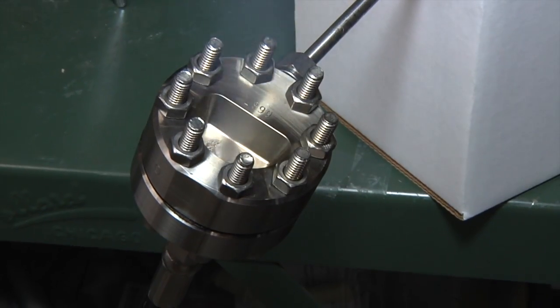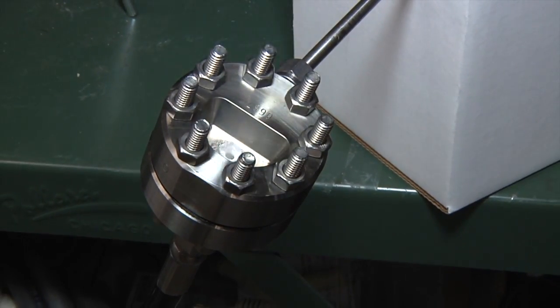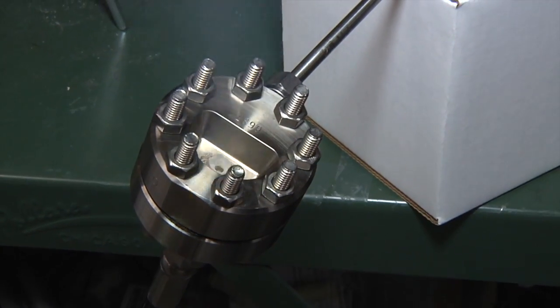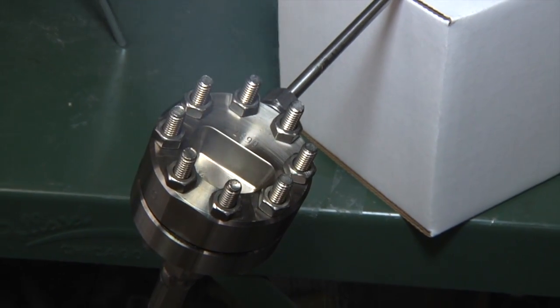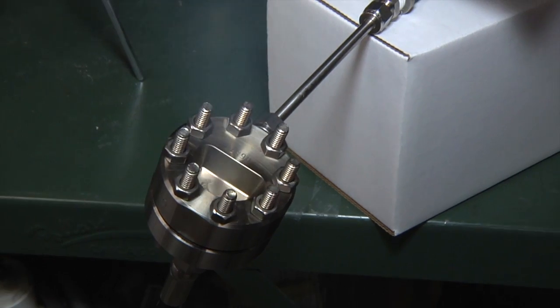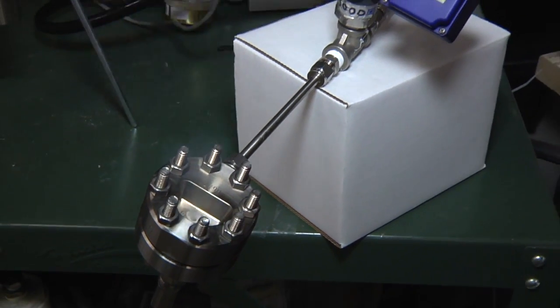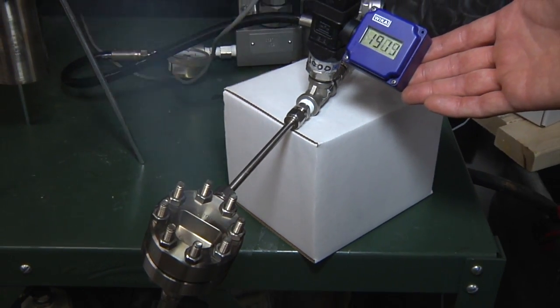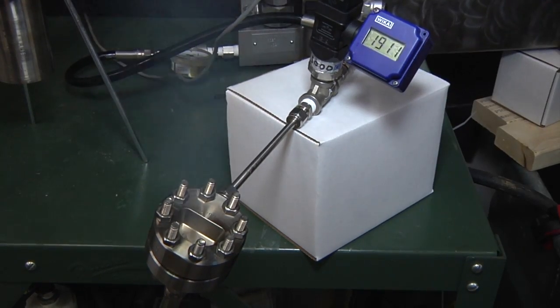All right, so now that we've been operating a little while, what I want to do is show you how the ice is really stretching across this expanding orifice. You can really see how the regulator's flow hasn't really changed that much, as well as the precision is maintained very constant at that half a percent accuracy range.